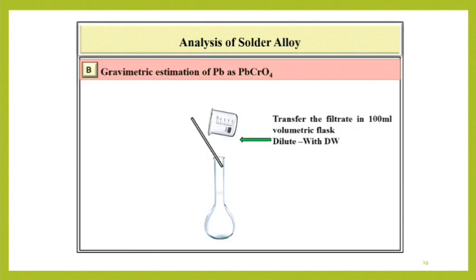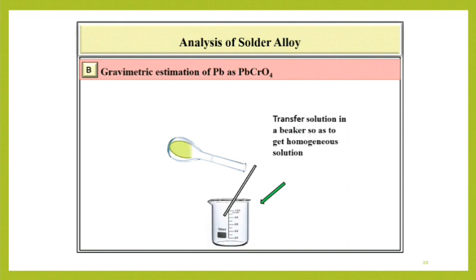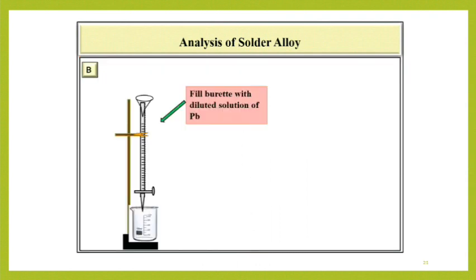Next is the part B, gravimetric estimation of lead as PbCrO4. For that, transfer the filtrate in 100 ml volumetric flask and then dilute it up to the mark by using distilled water. Now, transfer this solution in a beaker to get the homogeneous solution. Fill this diluted solution in a burette.